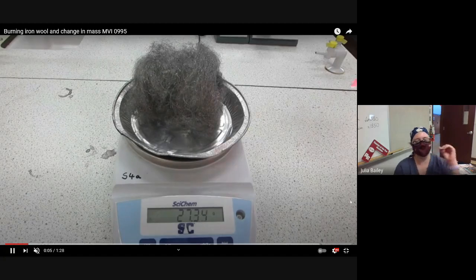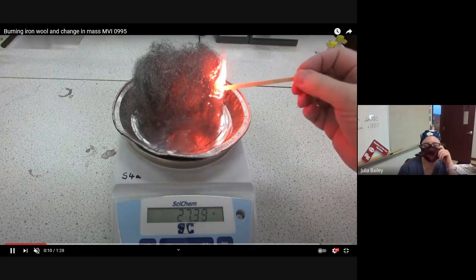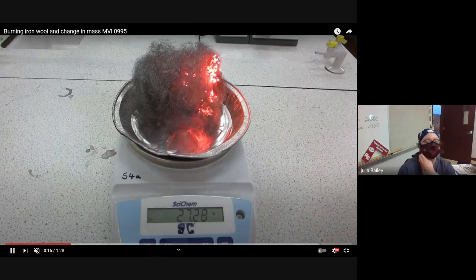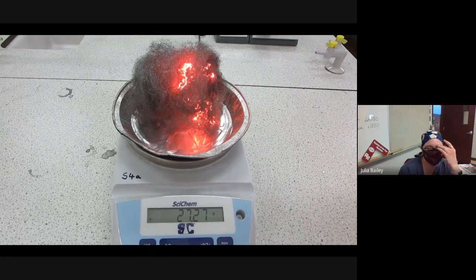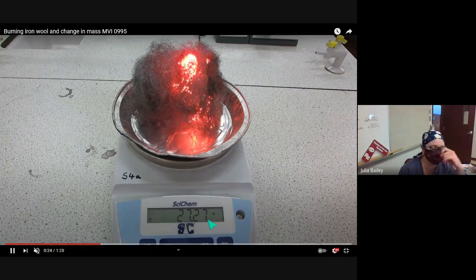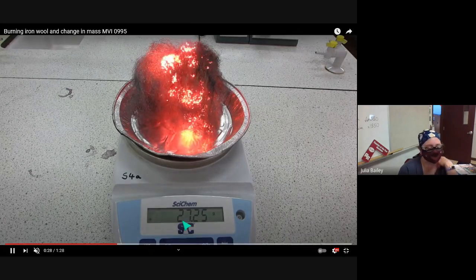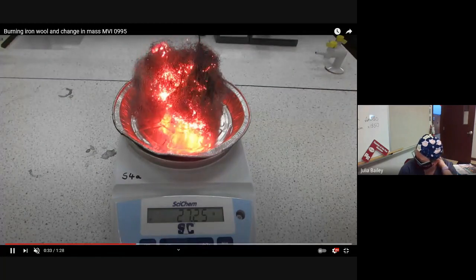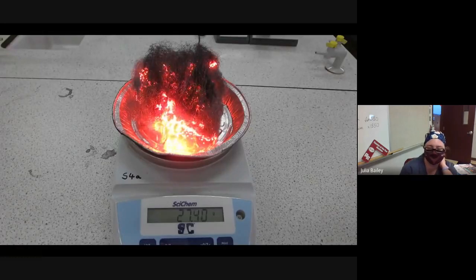And then in the video, they set it on fire. And they get it burning real good. And you can see the fire spread. It's really pretty cool looking, mesmerizing. If you look at the scale, the mass is changing. Right now, the mass has gone down to 27.25. And you're kind of like, okay, I kind of expect stuff to get lighter when it burns because you're losing a lot of mass to smoke and stuff.